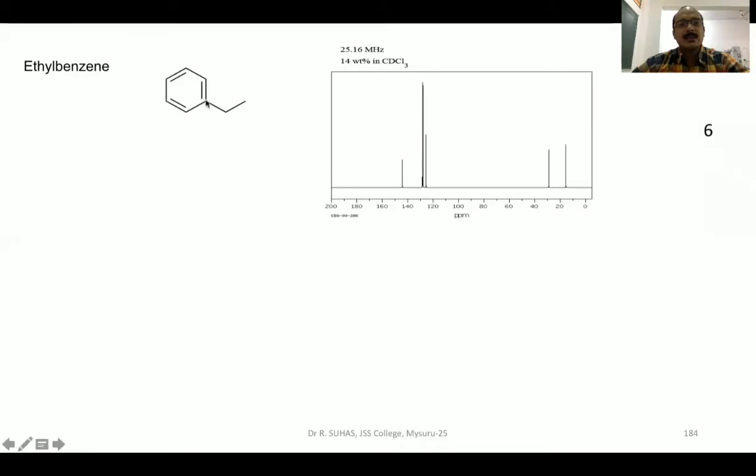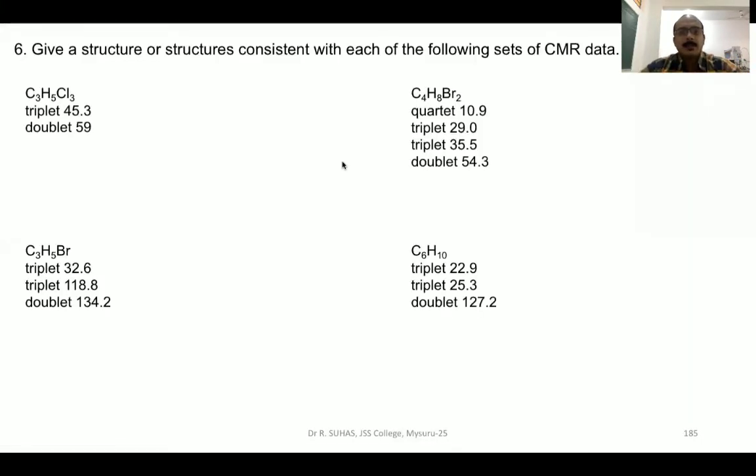Aromatic carbons fall in the range between 110 to 170, and these will be definitely coming in the aromatic region. So here this carbon is different: 1, this 2, 3, and 4, and you will see that these 2 peaks are merged here. You cannot see completely, but when you zoom the spectra, you can see one is short and one is slightly long. Based on that, you can say that there are 4 aromatic peaks and 2 saturated peaks.